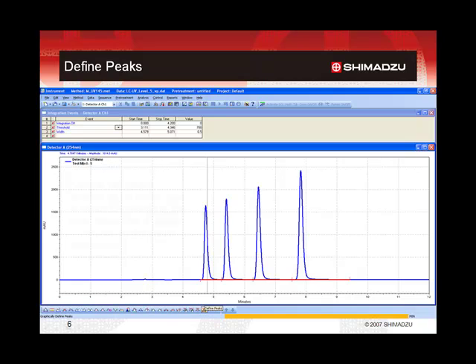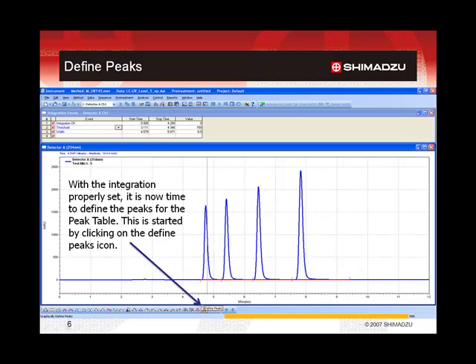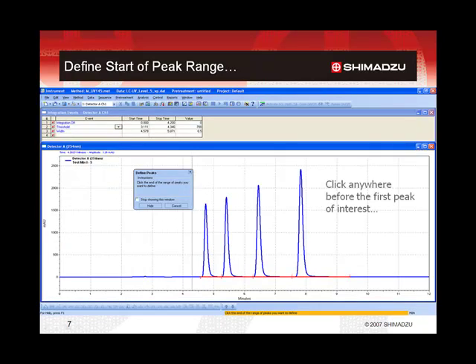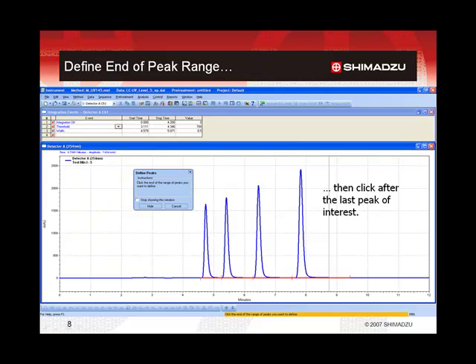Once the integration of the chromatogram is satisfactory, the next step is to define the peaks that will be included in the peak table. This can be started very easily by clicking on the define peaks icon in the integration events toolbar, typically found at the bottom of the window. The define peaks applet will suggest that the peaks can be defined by graphically indicating the time range where the peaks of interest elute. This can be done by clicking anywhere before the first peak of interest, then clicking after the last peak of interest. The software will then be able to list any integrated peaks in that time range.